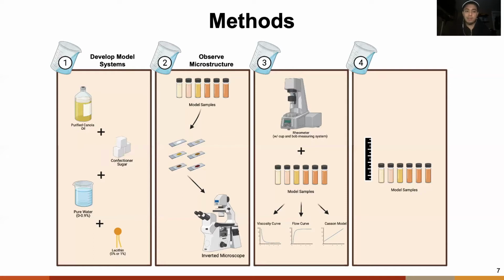And then finally, I'm also going to look at it through fluorescence microscopy. And so to look at it through fluorescence microscopy, I have to add a fluorescent dye to my systems. And so that's why, as you can see here, the 6 systems have different colors. And so that's because we can add a reddish orangish dye, which will light up. It'll mix with the water and it'll light up depending on where that dye water solution actually ends up in the sample.